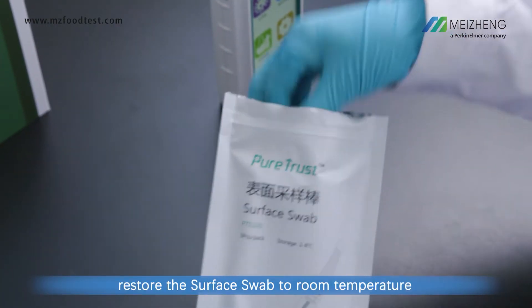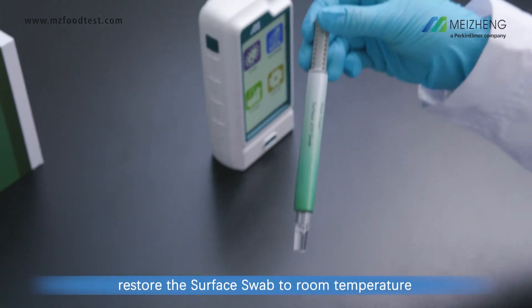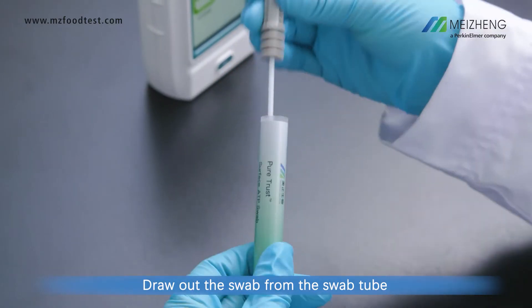Before collecting the sample, restore the surface swab to room temperature. Draw out the swab from the swab tube.